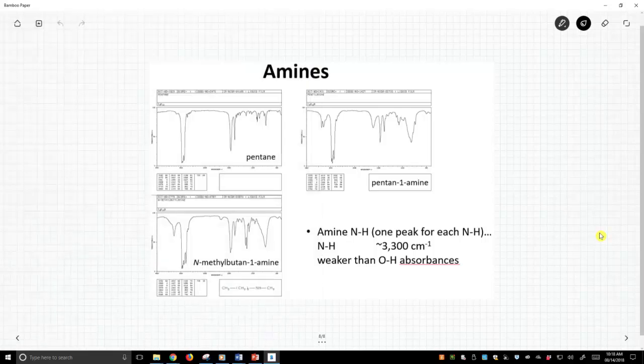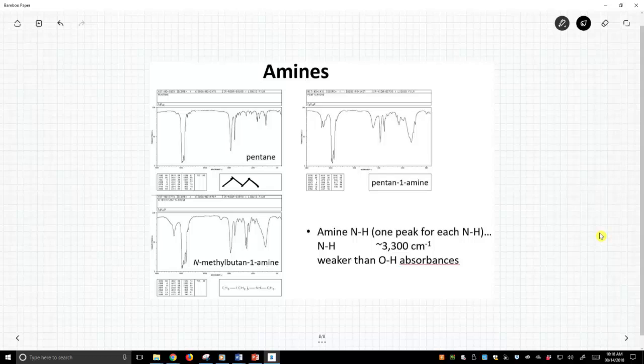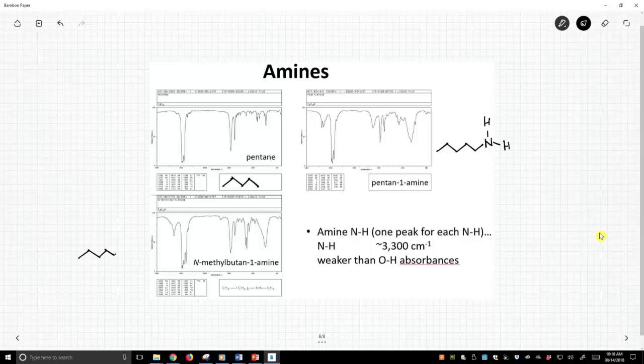Here is pentane again. We'll always start with this molecule. Now here is 1-pentanamine. That is that structure. And down here is n-methyl-1-butanamine. That's it. We've got a CH3. There's our methyl group. We have 1 NH.